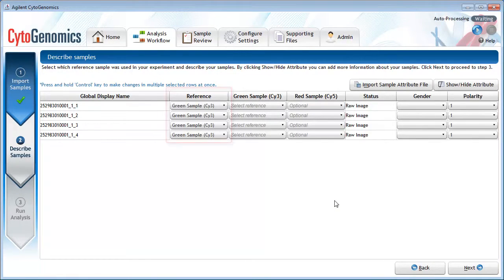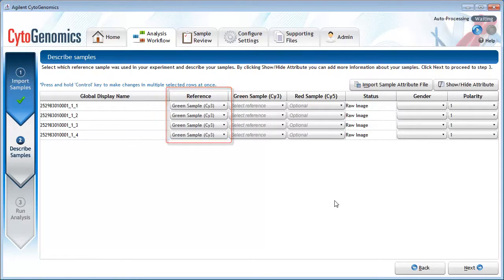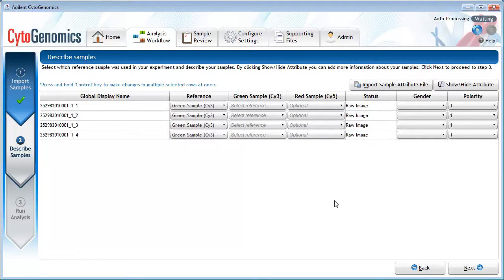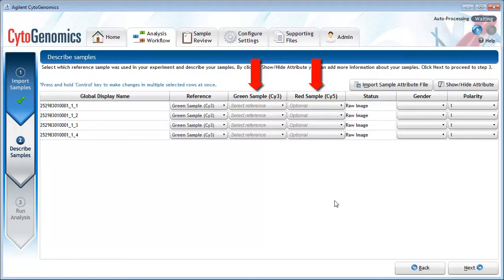By default, the green sample is selected as the reference sample. Change this setting only if you used red for the reference sample in your experiment. For whichever sample you select as the reference, the green sample or the red sample, you will need to describe that sample in the appropriate column.